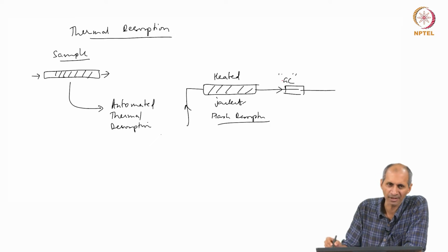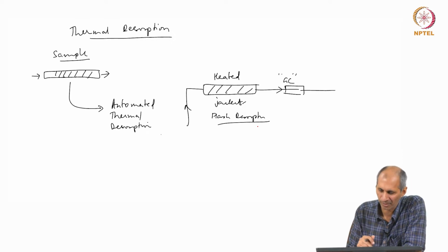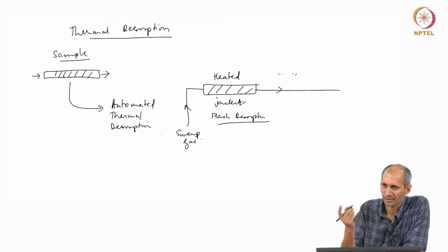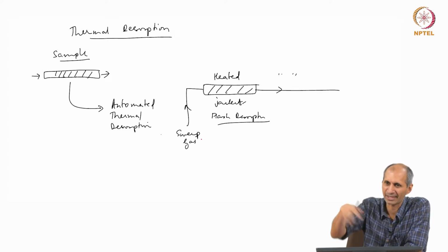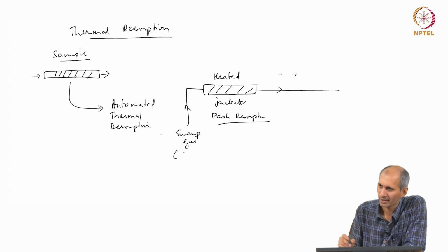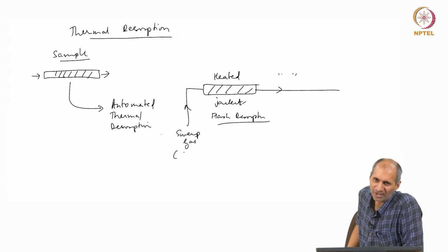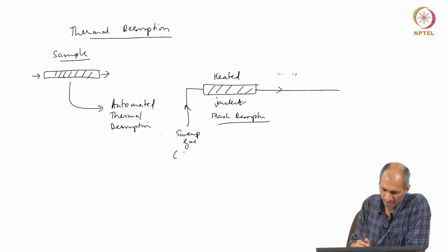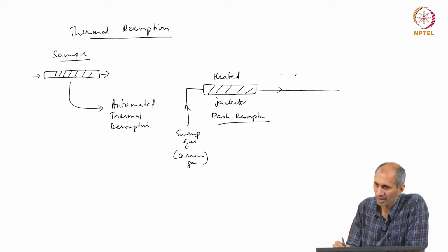So, it is a very interesting system, a lot of chemical engineering concepts go into this, and how quickly you can convert this into a pulse sample. There is usually a sweep gas, and that is essentially what it does: whatever is now desorbed, it just takes it and flushes it out. It is usually the carrier gas that is used in the GC. You do not want something else mixing with it, so whether you are using argon or helium or nitrogen there, you use the same thing here. So, it is usually the carrier gas of the GC, and it goes into the GC.